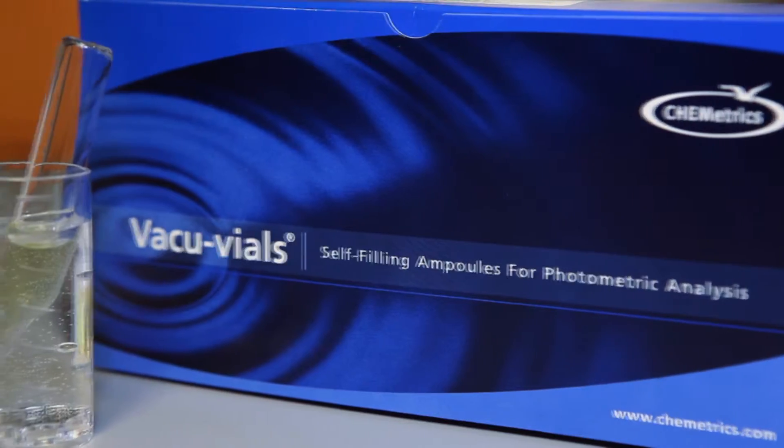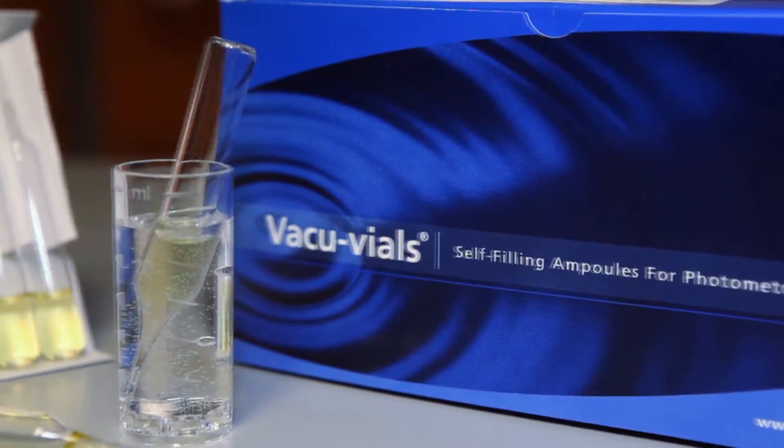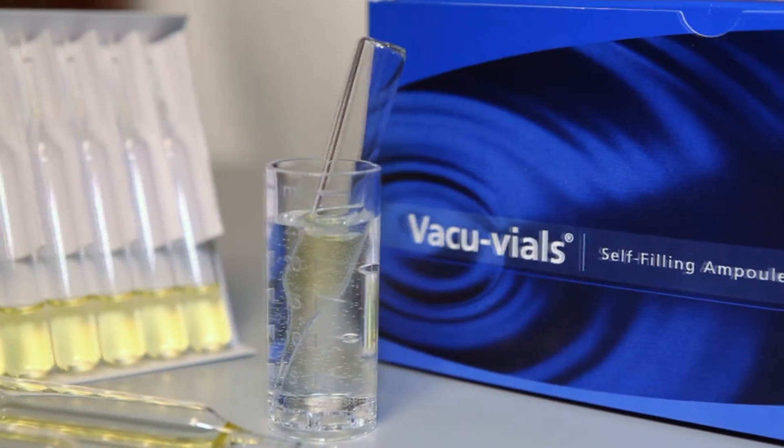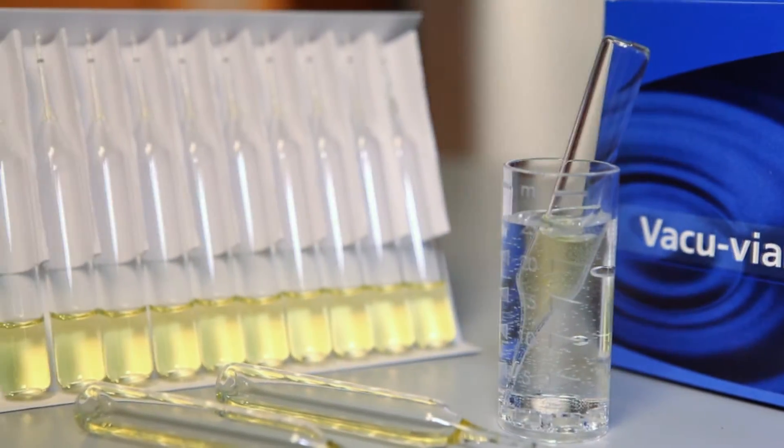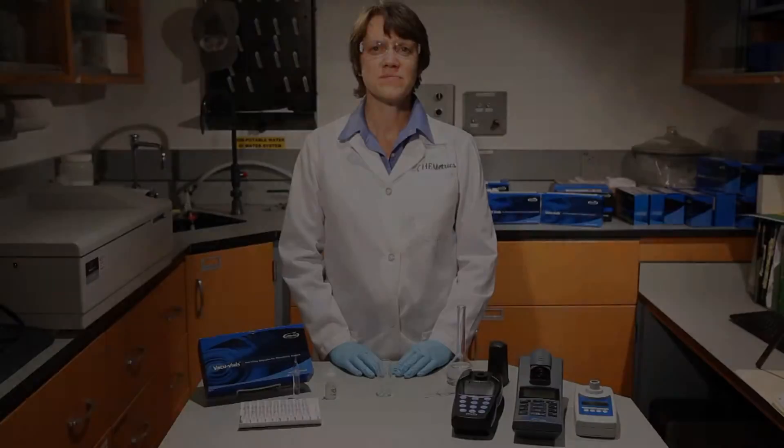Each Vacuvial Ampule contains a unit dose of color forming reagent sealed under vacuum, making this method one of the fastest, easiest reagent systems available for precise analysis of water samples.